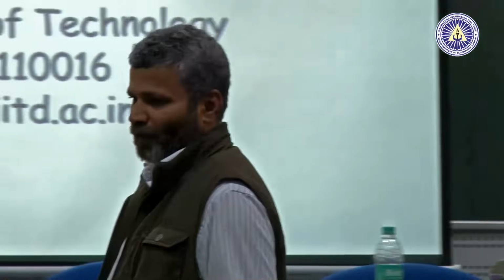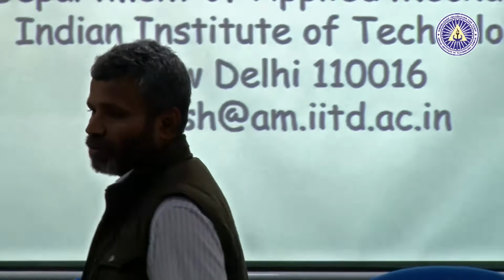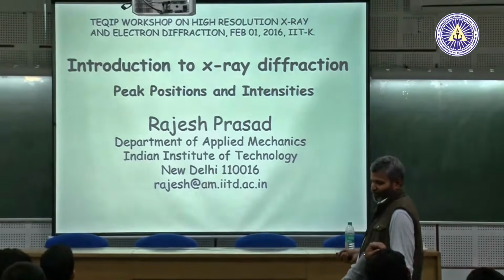It is a connected topic. In fact, in a sense the topic should somehow come before crystal, because how did mankind come to know that there are 7 crystal systems, 14 Bravais lattices, or that copper is FCC, or C60 is also FCC, and so on. So, that experimental technique which establishes crystallography is X-ray diffraction.